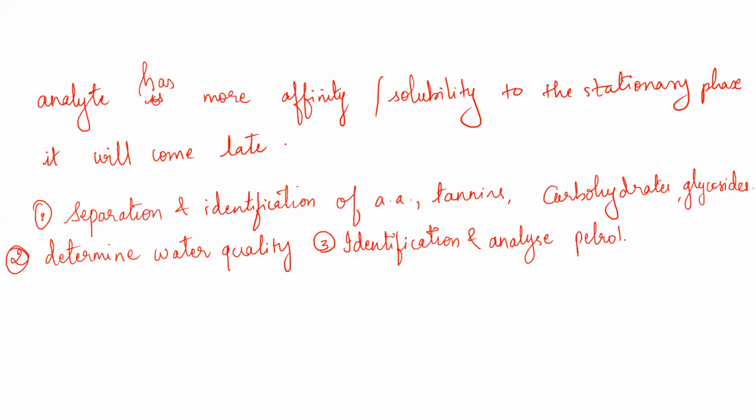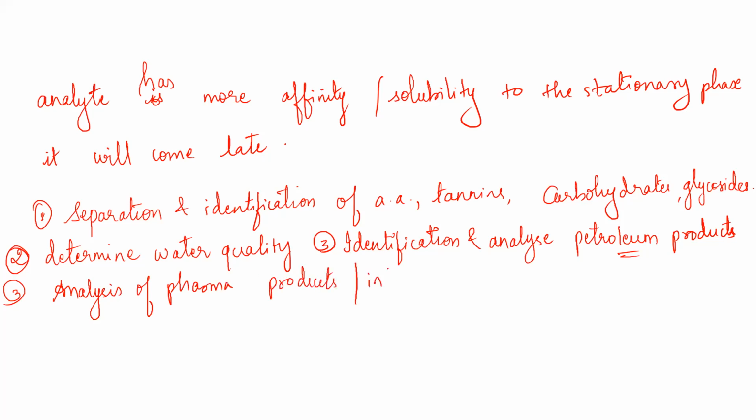petroleum products also, because we know that it's a mixture. Fractional distillation also is done of this to attain a lot of important intermediates. Similarly, we can also use chromatography to do that. And then analysis of pharma products, intermediates. So these are the important applications.